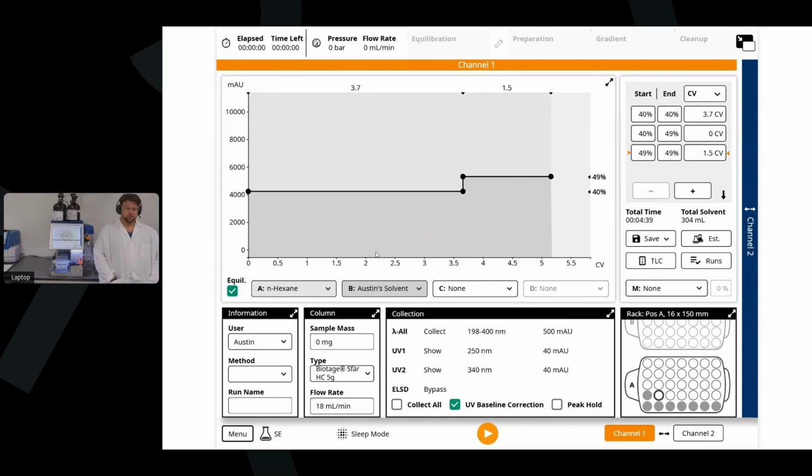Great question. As I mentioned earlier, because we can look at a bunch of different wavelengths all at the same time, we're not going to miss a molecule. I see a lot of literature values reported for different compounds, and sometimes they're all over the place, so I never really know where my compound is going to absorb. By scanning all of those wavelengths in the analysis portion, you get to see where your compound is absorbing at its maxima, so we can tune it in that sense. And so you won't miss anything.